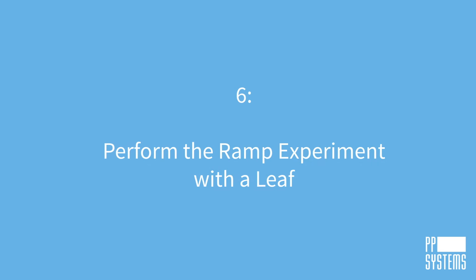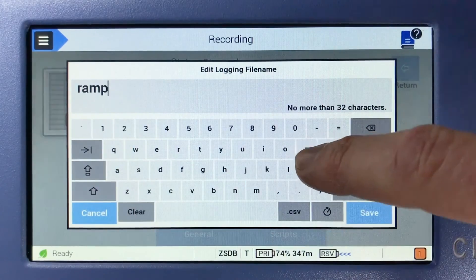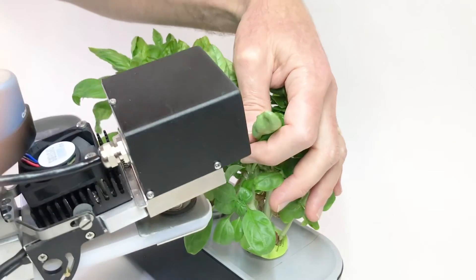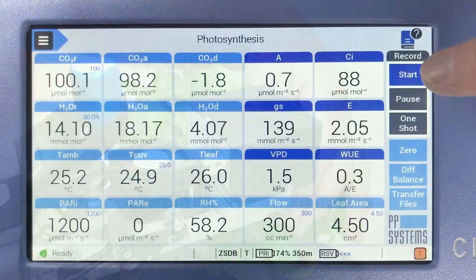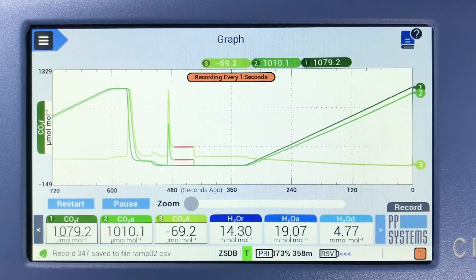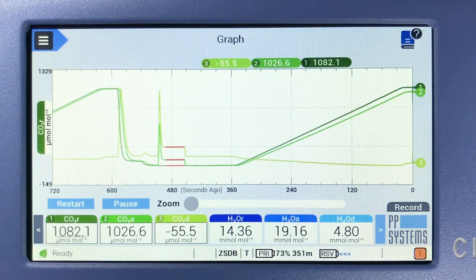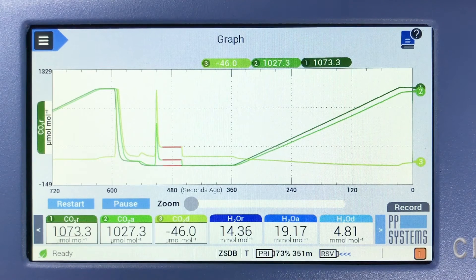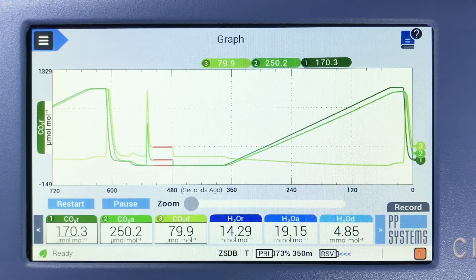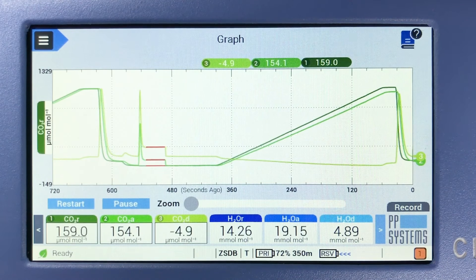Next, we'll perform the ramp experiment with a leaf in the cuvette. Tap Record Options on the command menu and enter a new file name and comments as in Step 4, and tap Return. Now, with a leaf in the PLC4 universal leaf cuvette chamber, tap Start. As you watch the plot of A versus time for the ramp with the leaf, it becomes clear when CO2 saturation occurs, at which time the ramp can be terminated by selecting Stop. You also have the option of letting it run to completion, in which case an additional 30 seconds of data will be recorded automatically. Once the ramp is complete, the CO2 control returns to the initial setting and is then ready for the next ramp experiment.